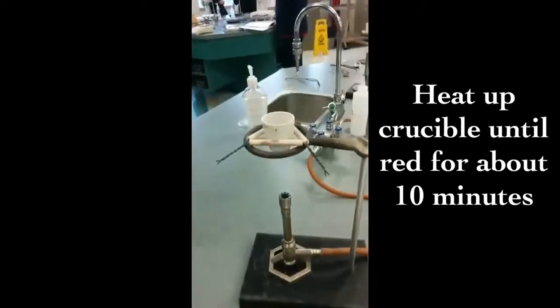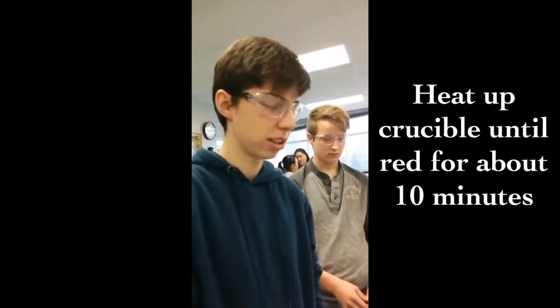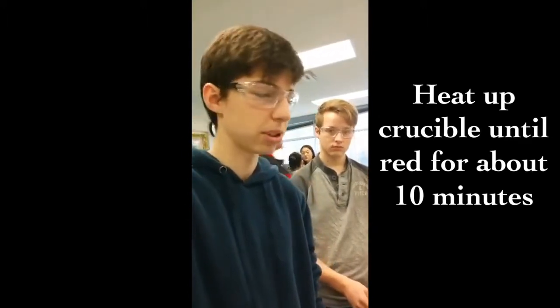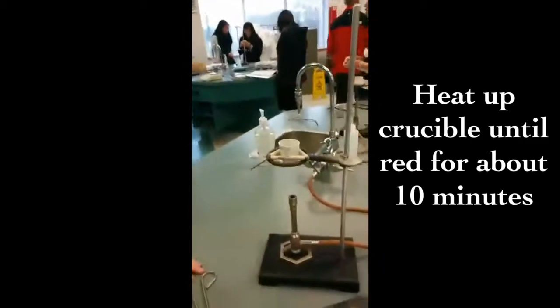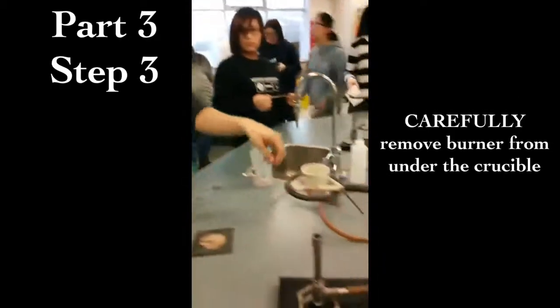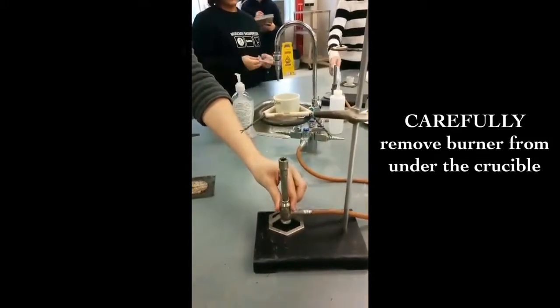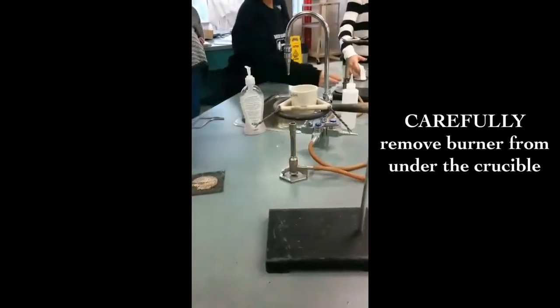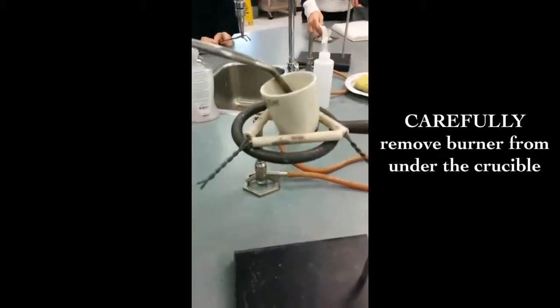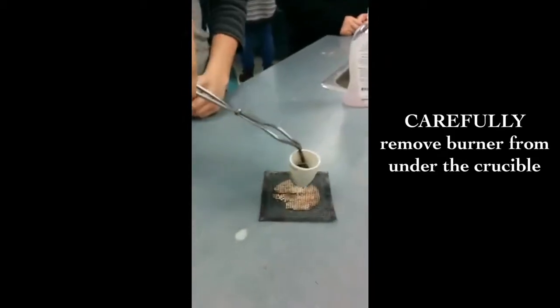After a few minutes, the crucible is going to glow a dull red. That means it's really hot. After it glows red, let's wait about 10 minutes before turning the Bunsen burner off. Now that it's been red for about 10 minutes, let's turn the Bunsen burner off. The apparatus is still going to be hot, so be really careful and use tongs to remove the crucible and place it on the cooling rack.